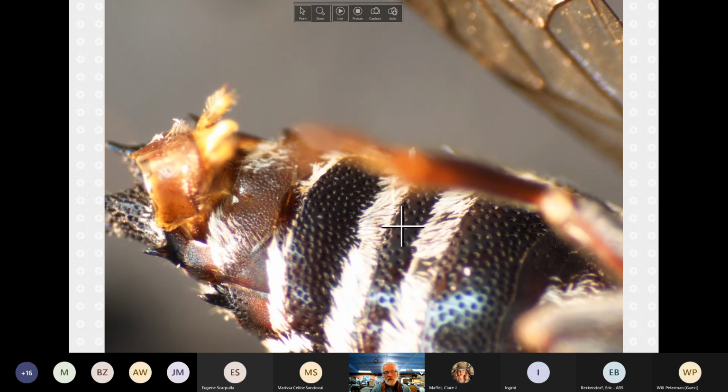Okay. So in general, what we're looking at is in 1, 2, 3, 4, you have a strongly sclerotized area and then a translucent extra area. I don't know what to call these differences, but there's a translucent part and a sclerotized part, usually very obvious to separate. And it's not visible here, but there's similarly two sections. This is the genitalia. Oh no, it's actually broken. So you can see the specimen has curled up. So bad example, we'll look at others.